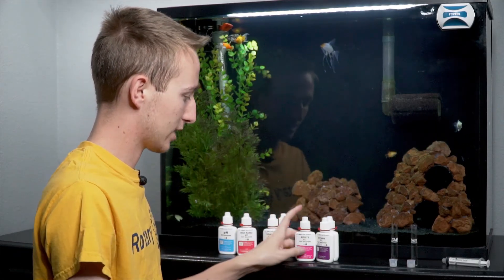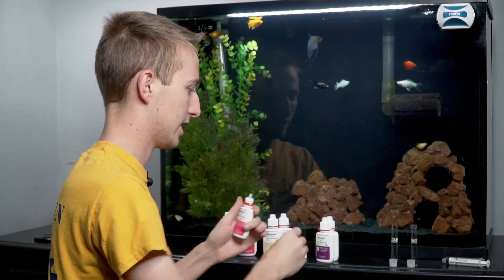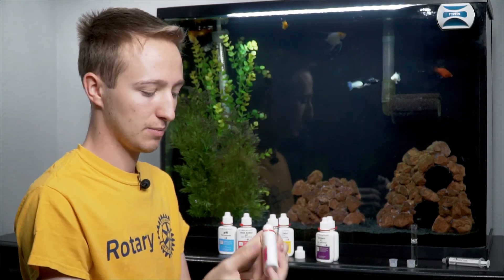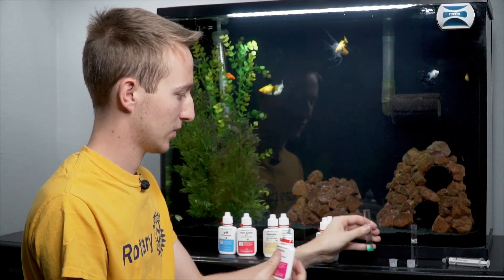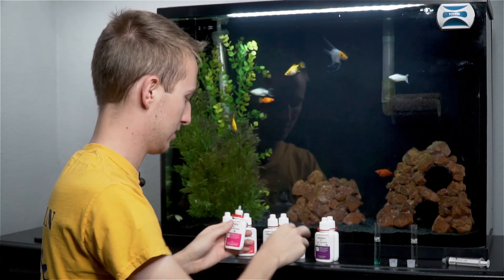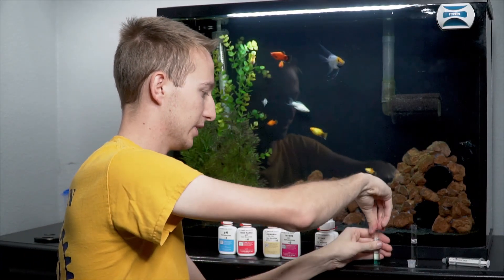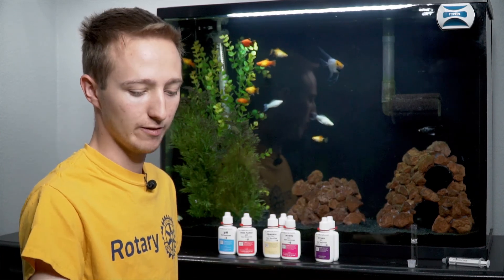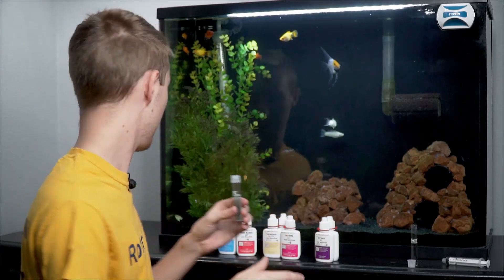Next is nitrite — this one is adding five drops to your test tube. You're going to hold the bottle upside down and add five drops, set the test tube down, cap the bottle back up, put the lid on the test tube, and invert it a couple of times. This one's ready to read pretty much instantly.